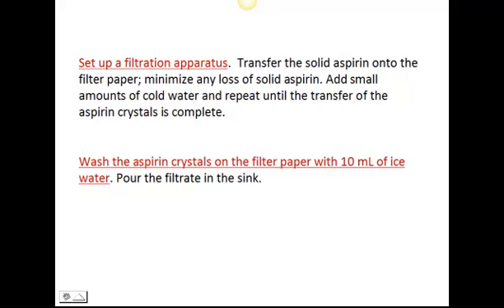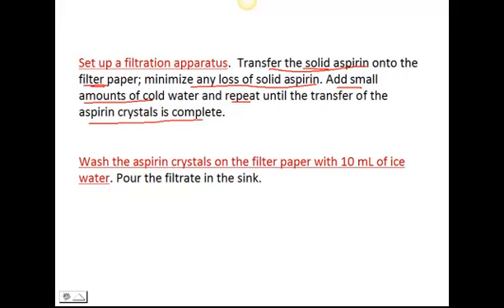Once you have the crude crystals — your solid crude aspirin — you're going to transfer them onto filter paper. You don't want to lose any of that solid aspirin. Transfer by adding small amounts of cold water and repeating until you've moved all the aspirin crystals onto the filter paper. I will show you the filtration apparatus. You will then wash the crude crystals with 10 milliliters of ice water to wash off any impurities.